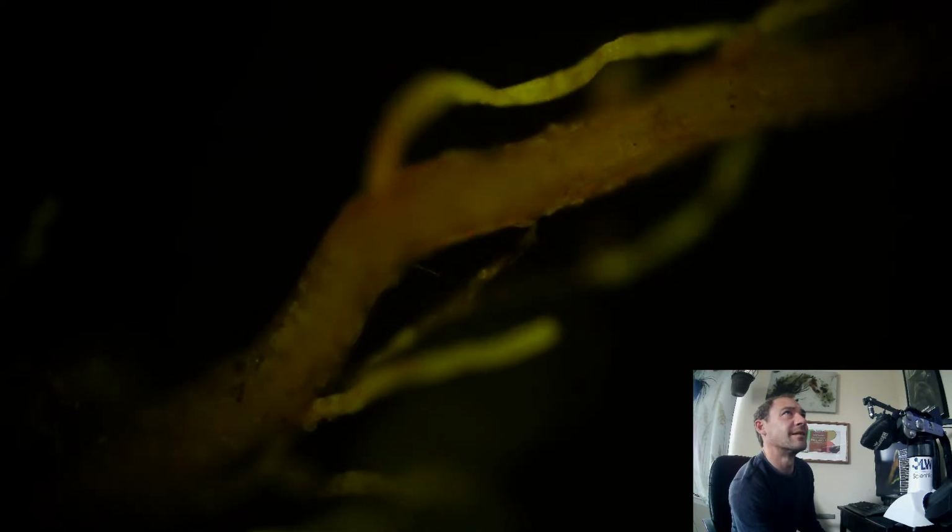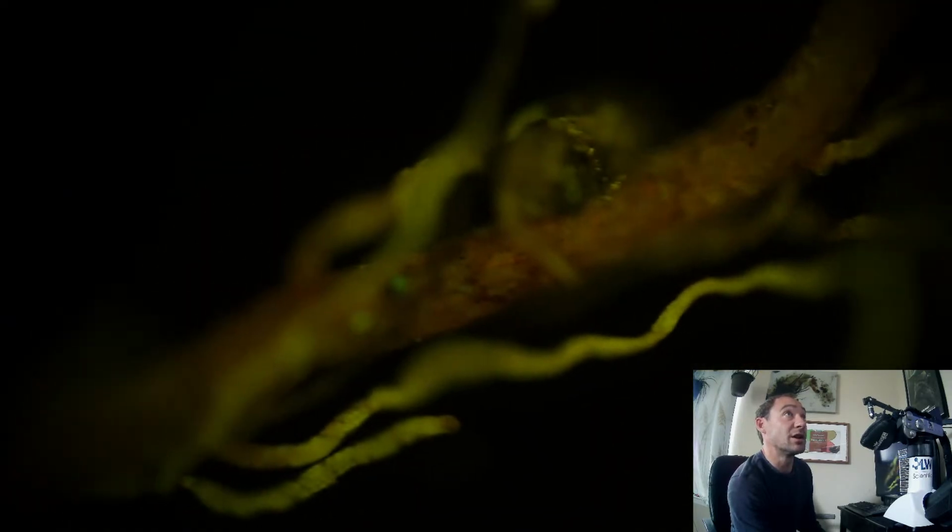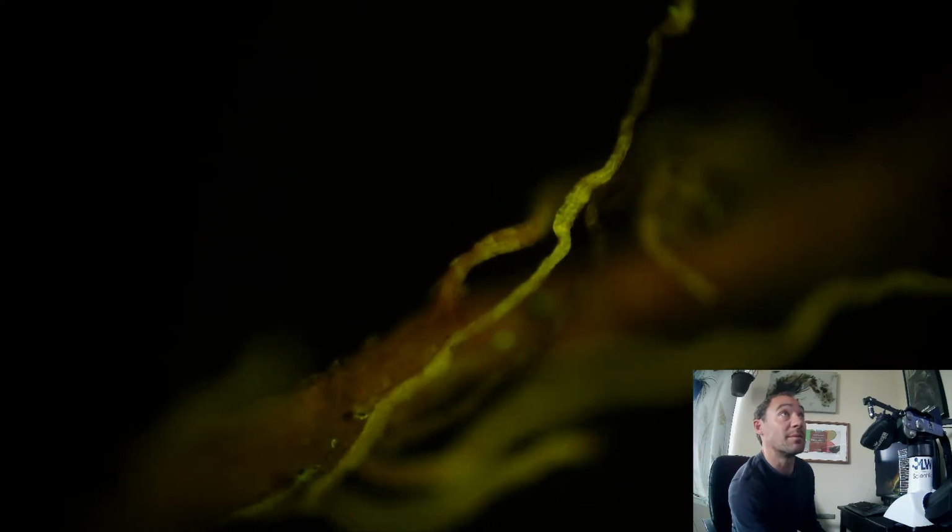Let's go up. Yep, we're going to go up one more in ISO, trying to find where the thicker part of this root is that's laying nice and flat. Let's follow this segment down. Get a little bit more focus in here. So it's tough to find. I had to go pretty close to the base of the blueberry bush, which is probably 10 years old or so.